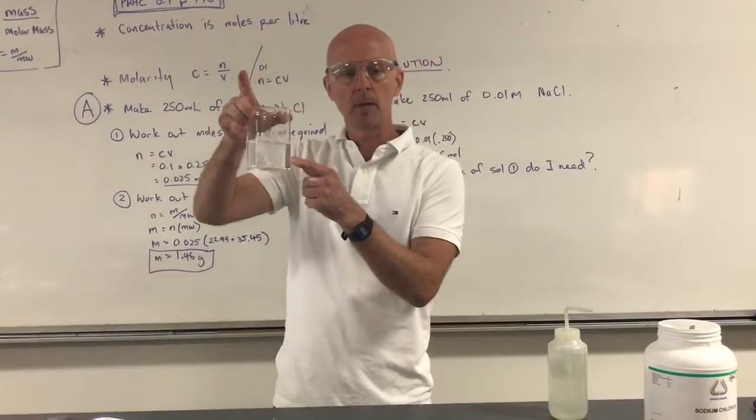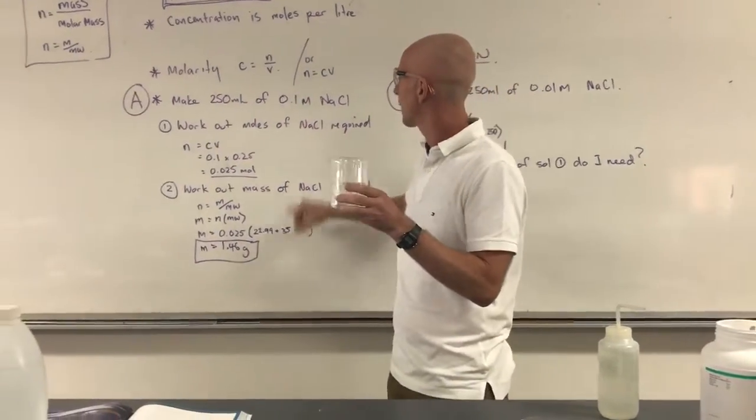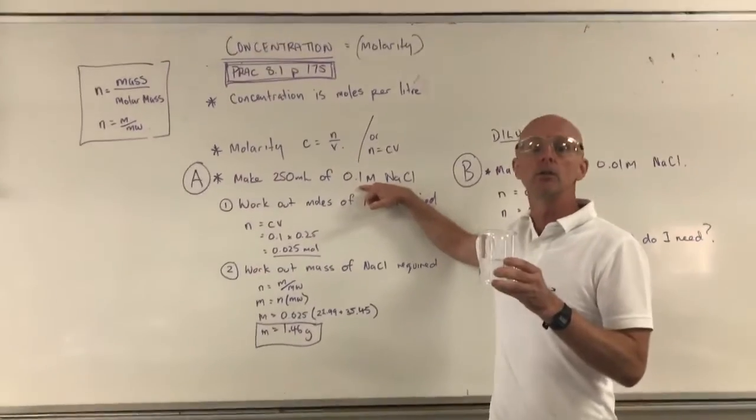And we know the exact amount of moles in there. We've weighed out the exact amount of moles. So we know the exact concentration is now 0.1.